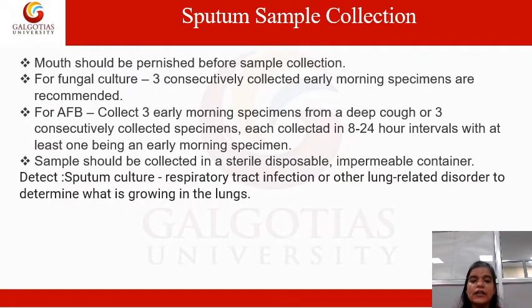Now let's talk about another sample, which is sputum sample collection. For sputum, again the mouth should be rinsed before sample collection. Again, for at least half an hour, or even more, it is prescribed not to have anything while you are going for a saliva test or a sputum sample.